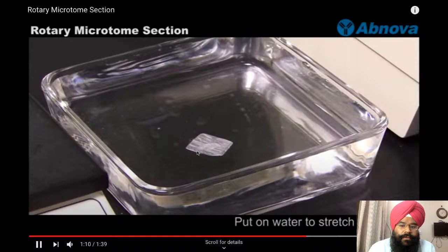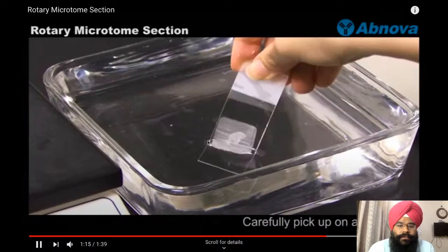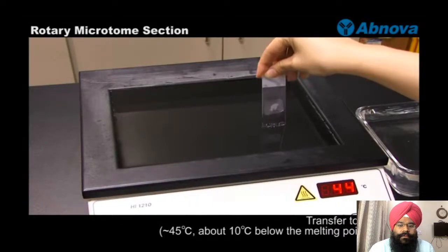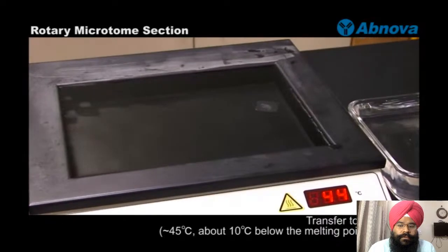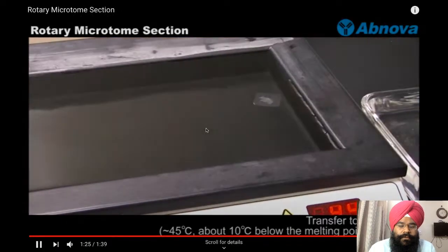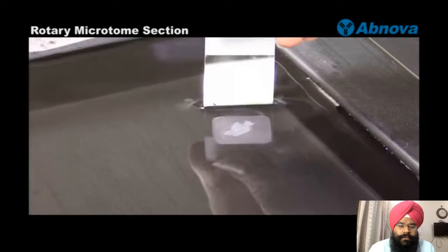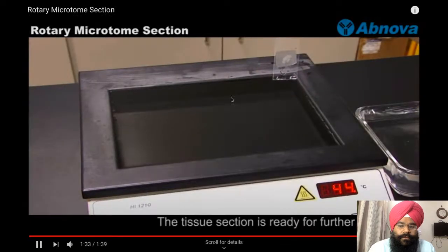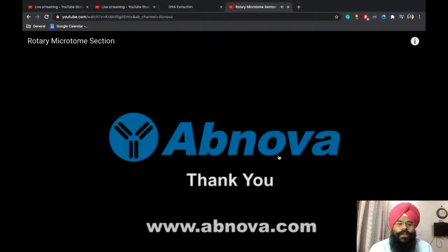They are stretched out like this. So that was about the microtome machine.